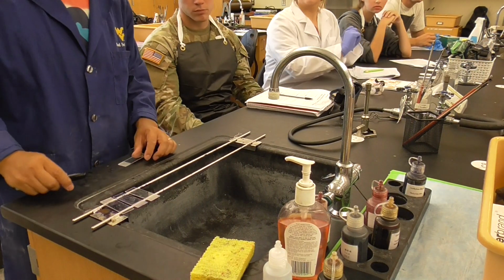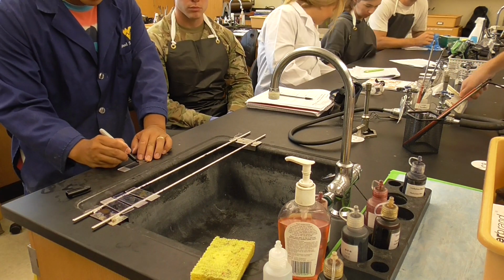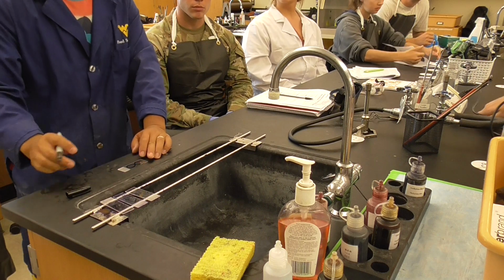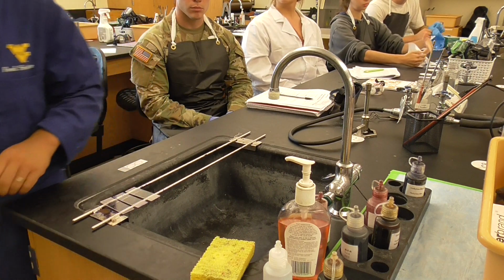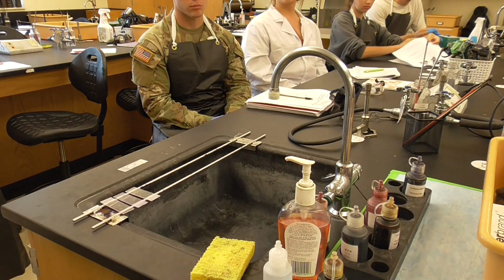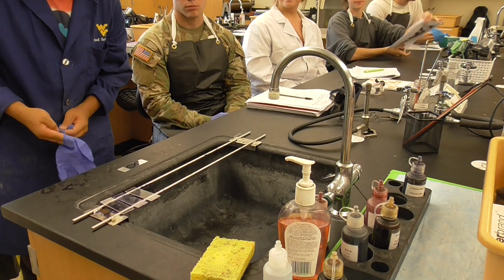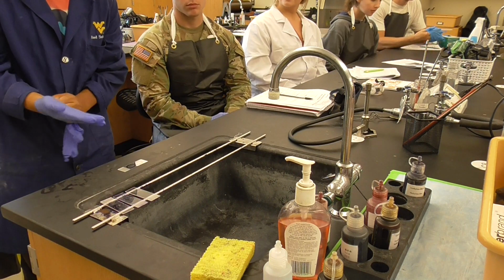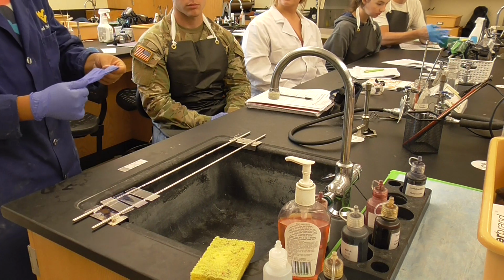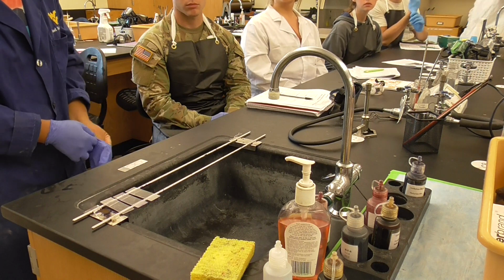So the first thing is we're going to draw a big circle right here. Okay. Now what did we forget? You have to wear gloves. Let me borrow some gloves from you. Ryan, next time, prepare one box of gloves for me. That is our box. Oh, this is our box.